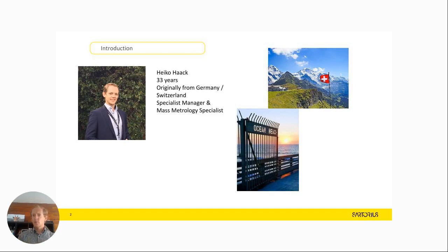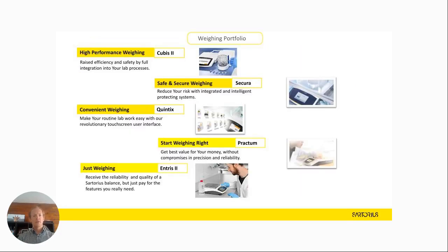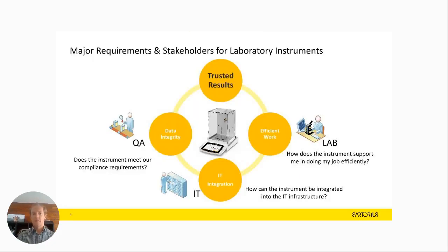As I already said, today we will talk a little bit about what data integrity means and how we take that into the lab. What could we answer? What could we avoid? And what does it require? Sartorius has a large segment of balances. Today, when we talk about a balance, it will be just about the Cubis 2, our premium product, because 21 CFR Part 11 is generally only available on the premium level.